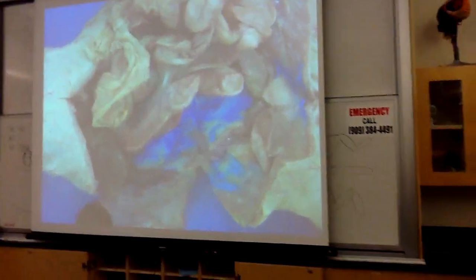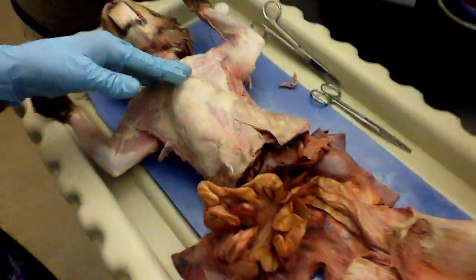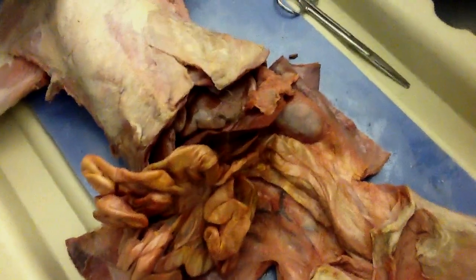On your human model, take all the intestine stuff out and look for the kidneys in the back. There is the kidney. See how they're stuck to the body wall in the back? Where's the other kidney on the cat?